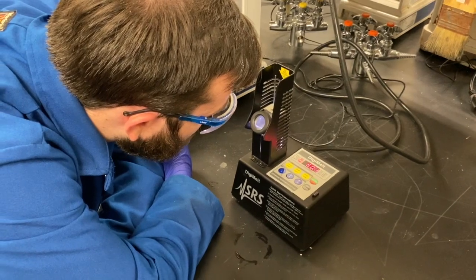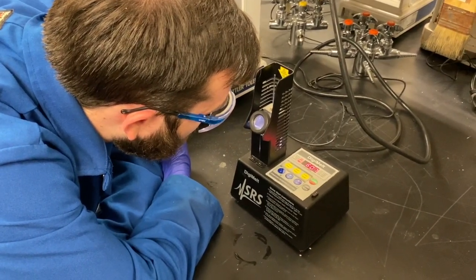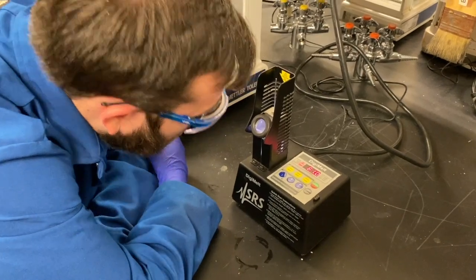It started melting now. And it is fully melted — 60 to 61 degrees Celsius.